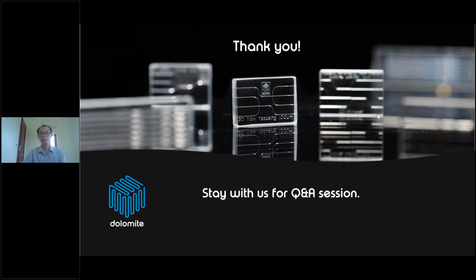So basically, in the UK team, I'm not sure about India. It strongly depends on the Indian market. But in the UK, the system will range from 30,000 pounds to 60,000 pounds. It depends on what kind of system is required, like single channel or ANPS, how many chip types you want, or how many module systems you want to use for your application.